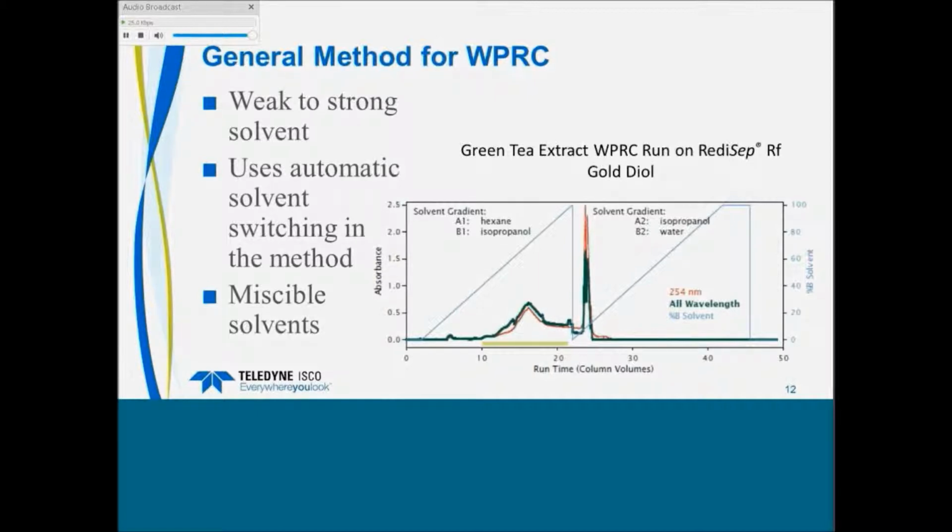problems. This is green tea extract, and in this case, chlorophyll eluted over here. This broad peak here was a mixture of alkaloids and phenolic compounds, and what appeared to be tannins eluted as I started to go into the aqueous gradient.